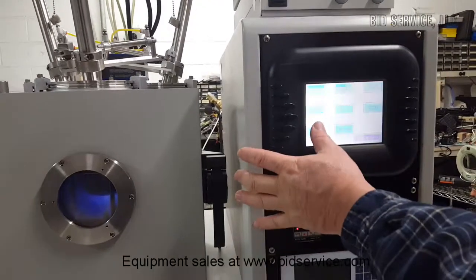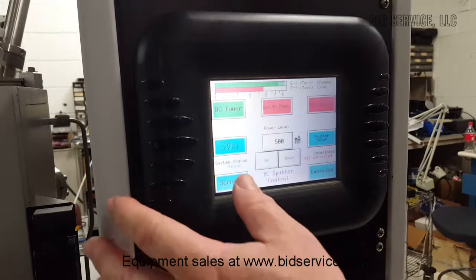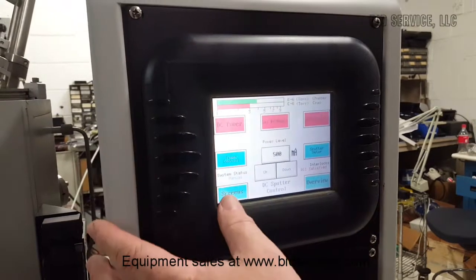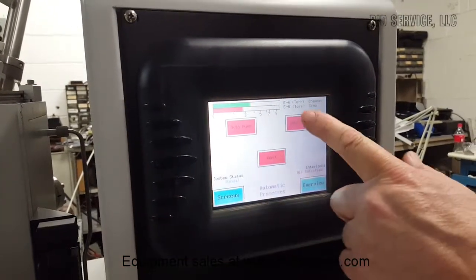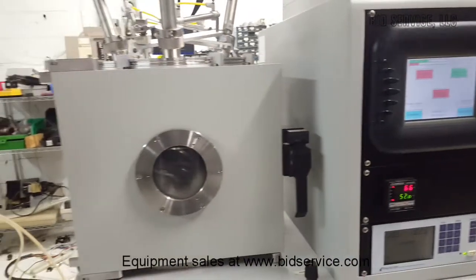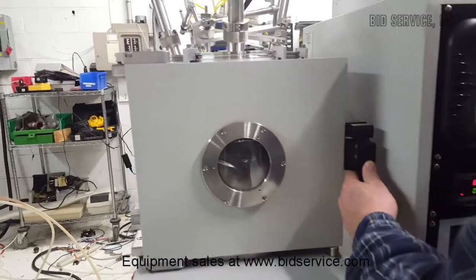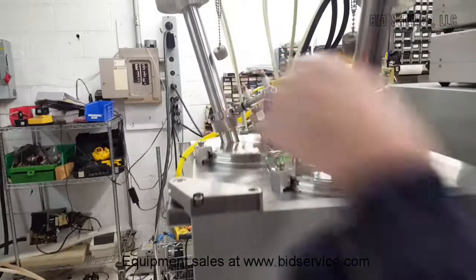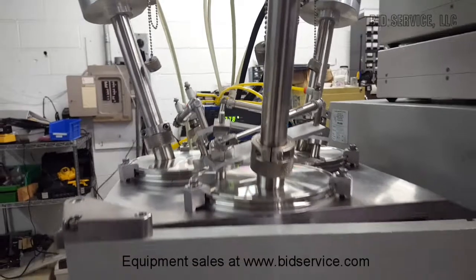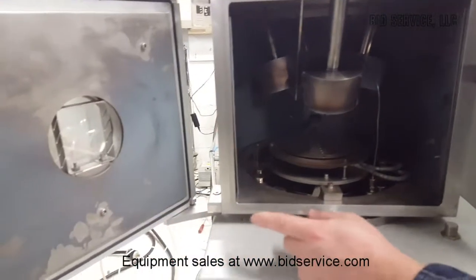Now I'm going to go over to the auto section. Let me make sure I turn off the gas and the power. I'll come over to auto and do an auto vent so we can look inside the chamber. To let you know that your chamber is at atmosphere, you can look at the gauge all the way back there and see where it says 770 — that is atmosphere.